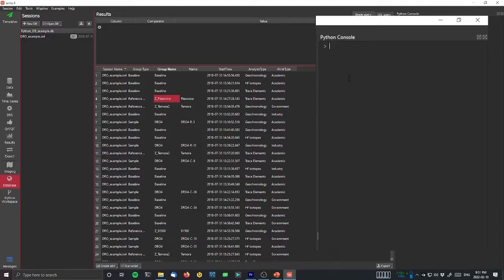So I'm going to say names equals db.column. We'll get the group name. It doesn't matter which one. Group name column, db.specified, because I'm selecting based on the group name.